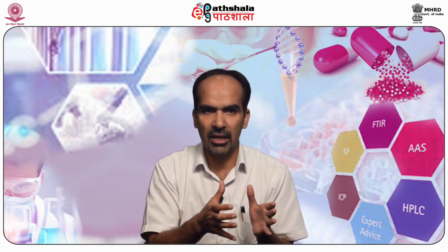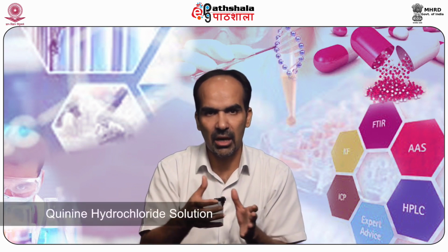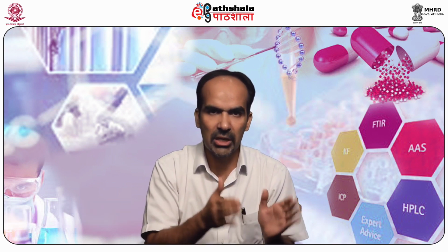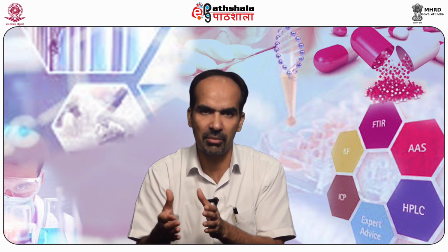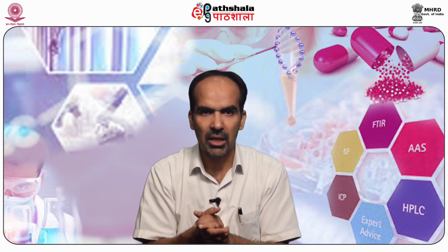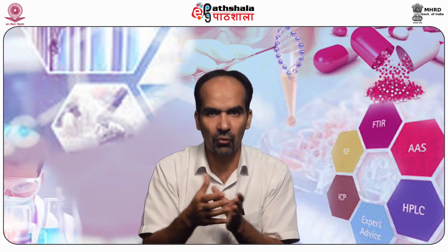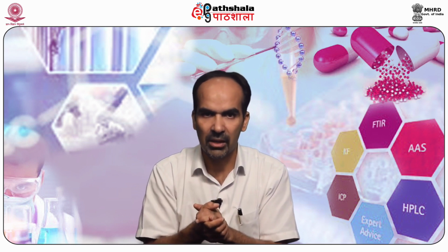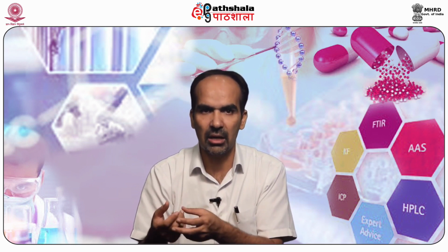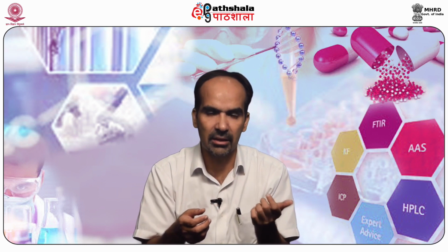In the same way, let's understand the assay of cinchona alkaloids in the form of quinine hydrochloride solution. From quinine hydrochloride solution, the alkaloid is liberated by addition of NaOH and extracted with successive quantities of chloroform, each chloroform solution being washed successively with the same portion of water. In this way, loss of quinine in water washings is reduced to negligible. The mixed chloroform solutions are evaporated, a little dehydrated alcohol being added towards the end.